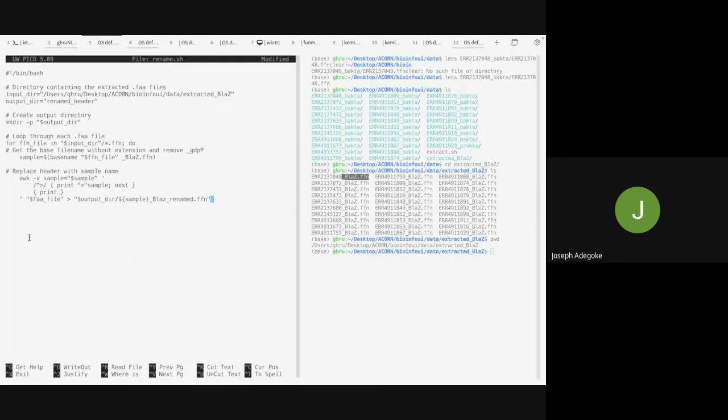To replace our header. I'm so sorry for this error here, the FFN. I'll fix it in the Colab notebook.